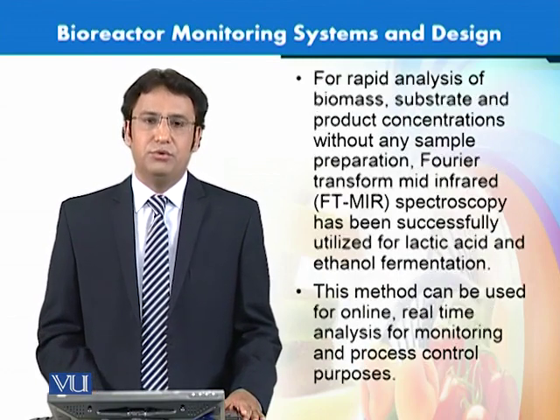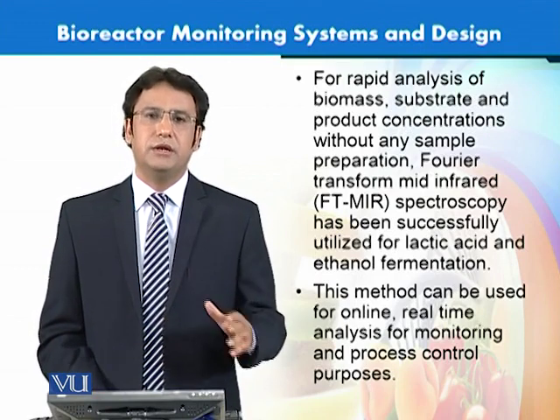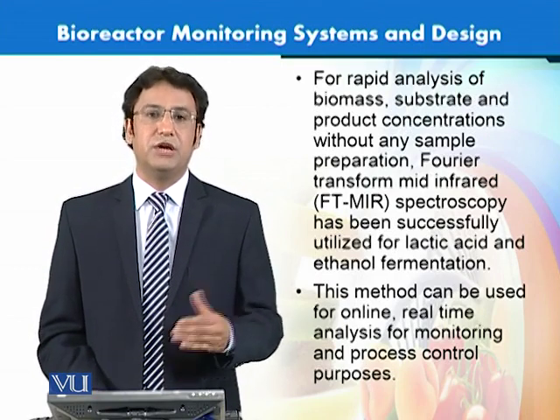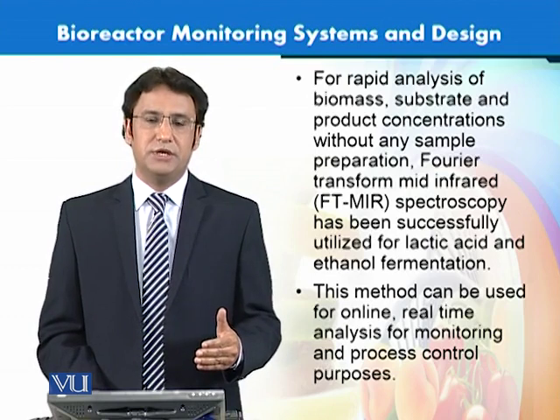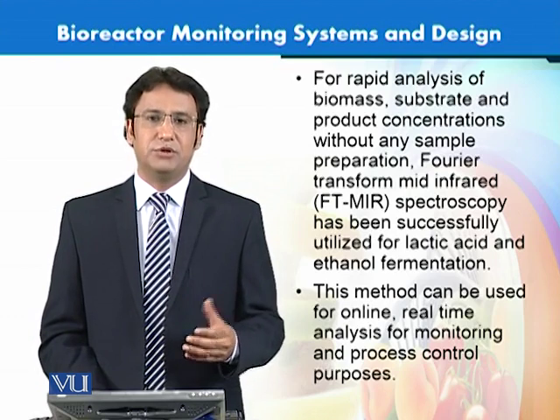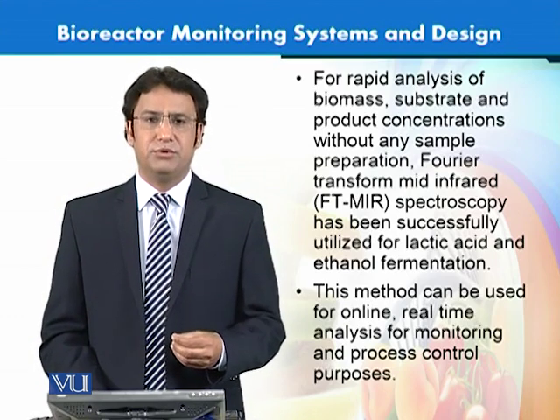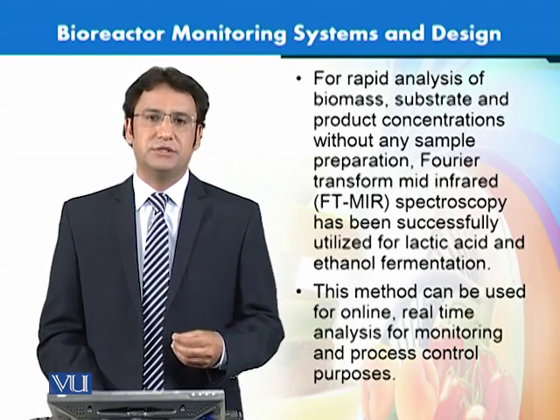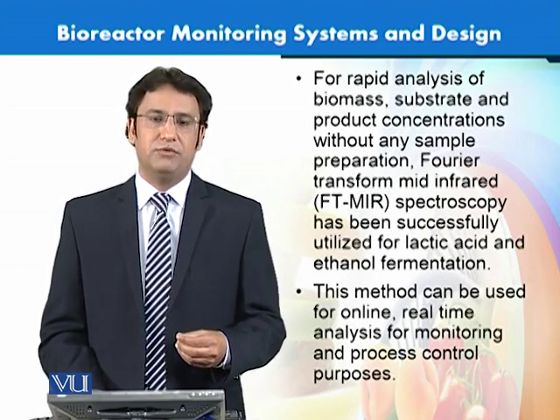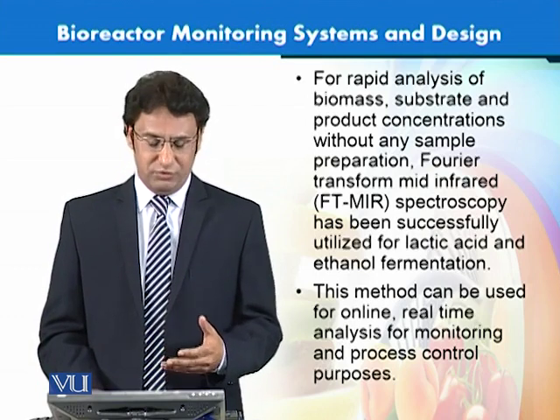So if we have to do rapid analysis, as I said, it is an online ongoing process. You have to do live monitoring of the bioreactor, and you have to take action if things go out of control. So it is very important to have real-time information. There have been a lot of new developments and research going into developing technologies which are more real-time, which can give you quick information.